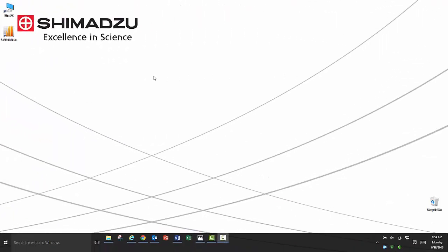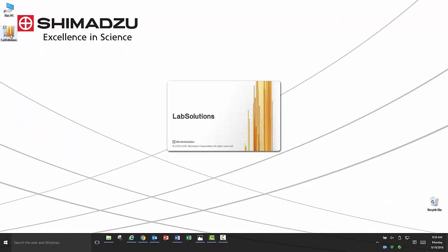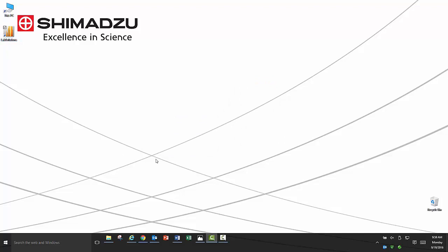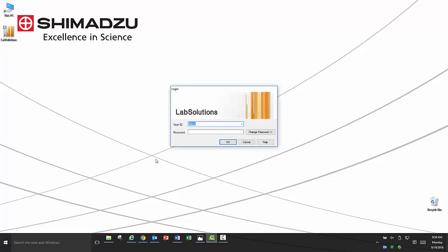To utilize the post run software, you will first need to launch LabSolutions. Once you have logged in, the main administrative screen will pop up.